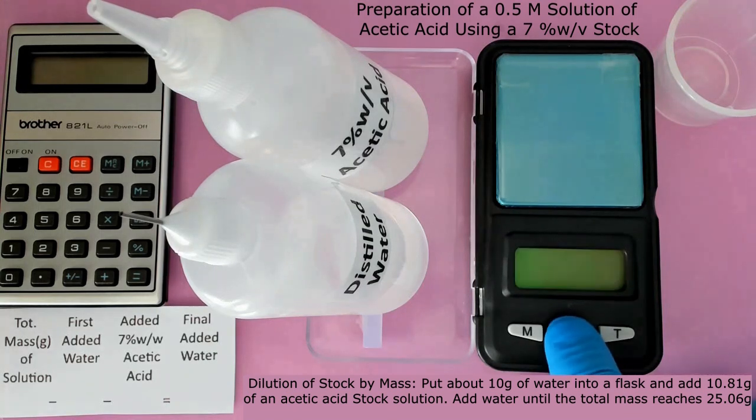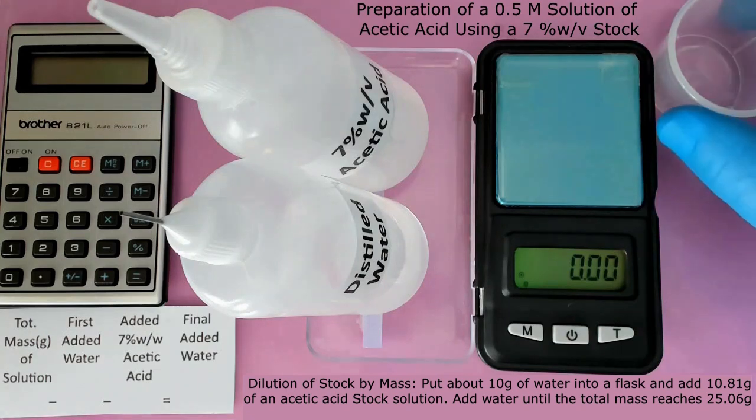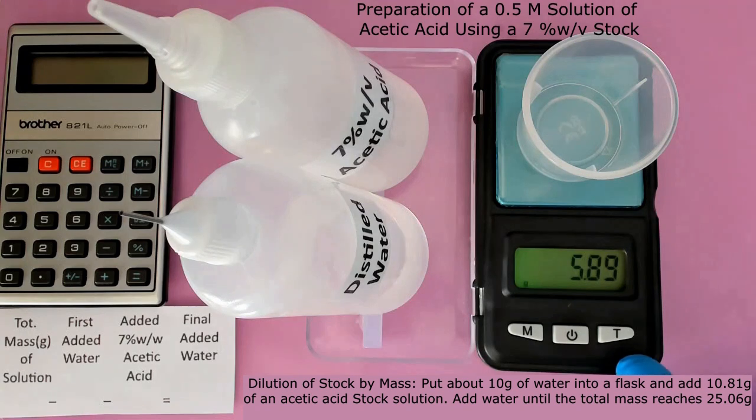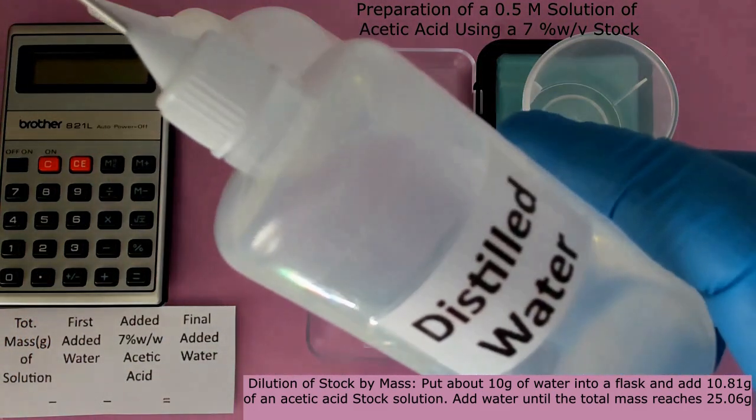Turn on and place a clean plastic cup on the scale. Press the tare button to reset the display to 0. Put about 10 grams of water into the cup.